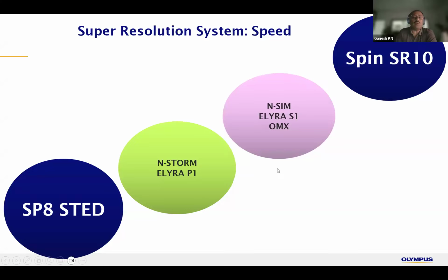So in conclusion, the spinning disk super resolution confocal microscope has helped us to achieve better resolution, sensitivity, and speed. It was further advanced by the SORA, which has helped us to achieve a better resolution of 140 to 150 nanometer. The SORA image was further taken forward with additional hardware by the Olympus Super Resolution to achieve 120 nanometer in real time. And this image was further deconvolved to achieve 90 to 100 nanometer in real time.